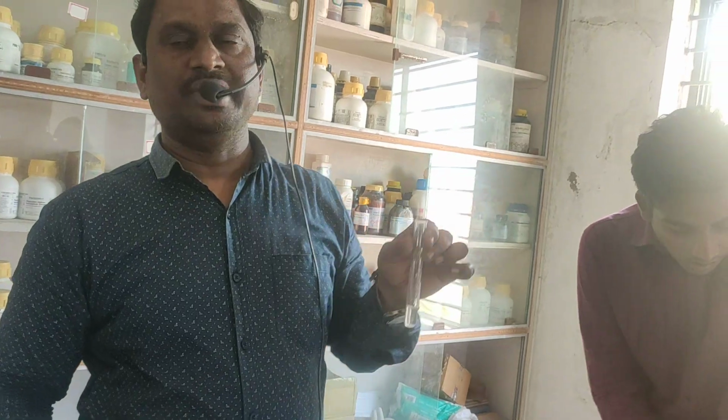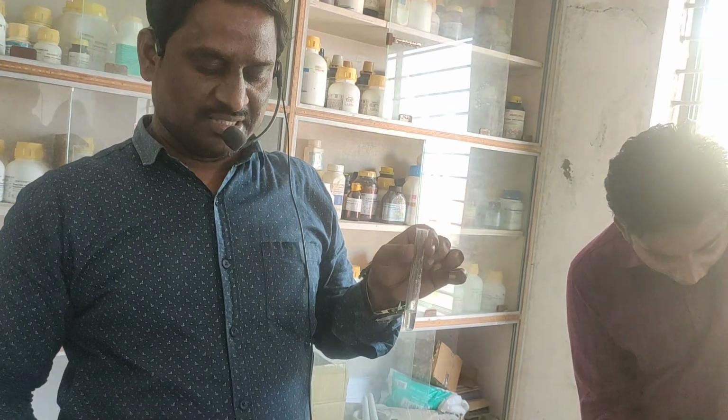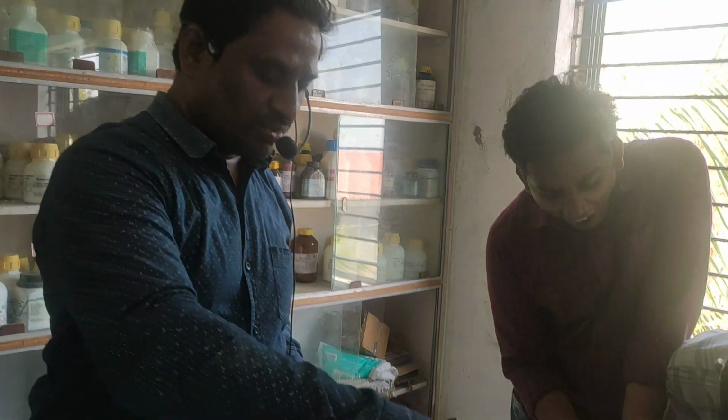NH4OH. No precipitate. Group 3 is absent.